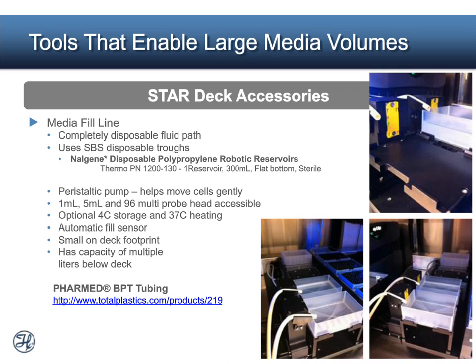Some accessories for the on-deck or the pipetting platform to handle the cells during the culturing process. Refillable reagent reservoirs for sterile media or cell suspensions is an important thing to consider and how those are being supplied to the deck. It's important to look at how it handles SBS labware and what types of formats. Can it handle multiple probe pipetting head? Can it handle independent channels, pipetting channels? And also, does it have a completely disposable sterile fluid path from the source container of media or cell suspension to the instrument's pipetting platform?